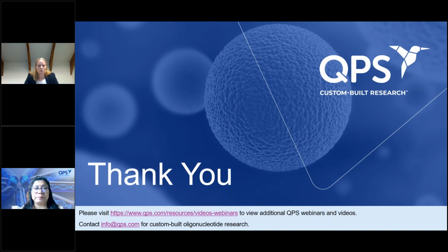Well, that depends on what your starting point is. So sometimes if your client already has done some work, you start off from there. If you have to start from scratch, then one of the things to keep in mind is do you have experience with the technique? For example, we have a lot of experience now with the two-step hybridization ELISA. For us that works, so you keep on going there and moving forward. So it depends mainly on what your starting point is.